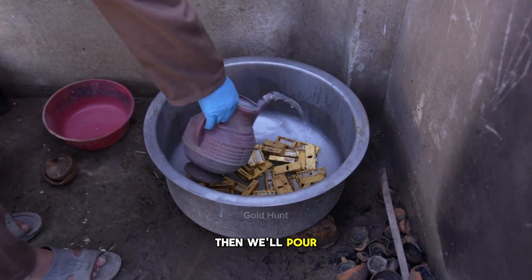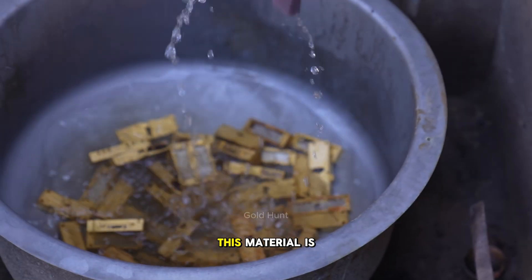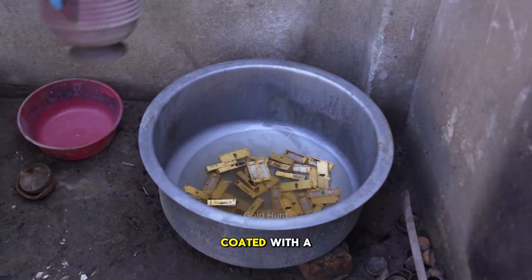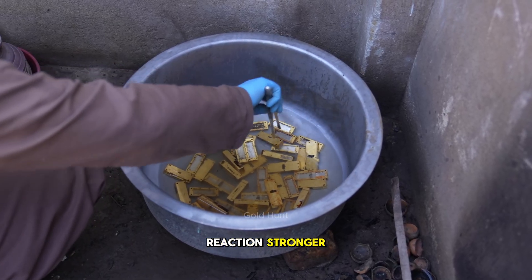Then, we'll pour in nitric acid. Now, remember, we won't add any water. The reason is, this material is extremely powerful — it contains iron coated with a layer of gold. So instead of water, we'll add the acid directly to make the reaction stronger.